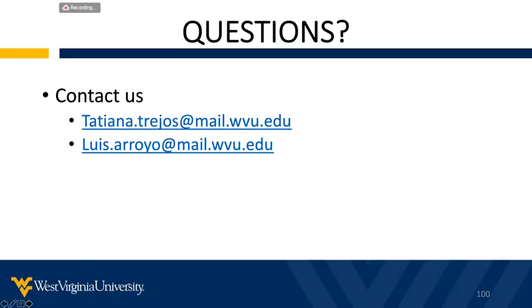All right. Next question that came in asks, regarding your study, are there any thoughts of doing a study on multiple shots fired versus just the single shot? Yes, that's a great question. We have done that so far with LC-MS. We have tried 1, 2, and 3 shots as well as 5, and we didn't find a significant difference. Sometimes you get similar results, sometimes you get less. So far in the experiments that we have conducted, it doesn't seem to increase in one direction or the other when you have 1 versus 3 shots.